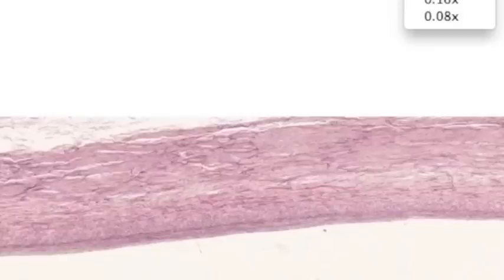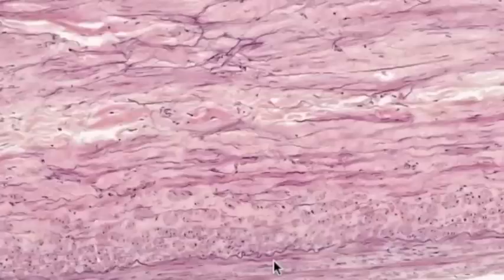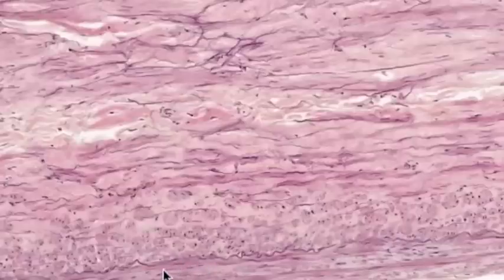We'll go into about 5x and take a look at the various layers of which this vessel is made up. The endothelial surface here is in contact with blood. From there to the tip of the arrowhead is the tunica intima. The boundary between the tunica intima and tunica media is this fairly distinct thickened layer of elastic tissue called the internal elastic lamina.